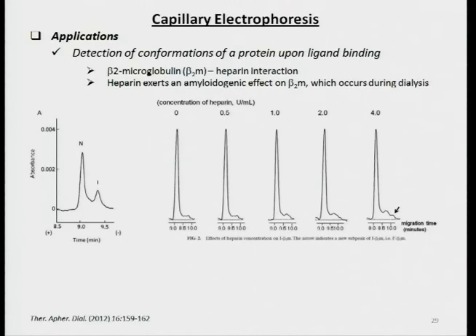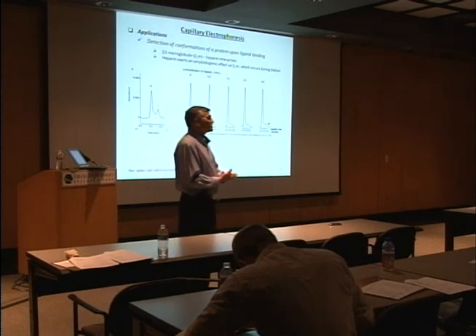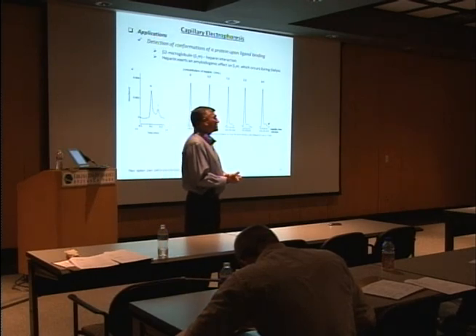So I think that's the end. In essence, that is the technique. You all are going to do one simple experiment on profiling oligosaccharides of chondroitin sulfate. Okay. Any questions?